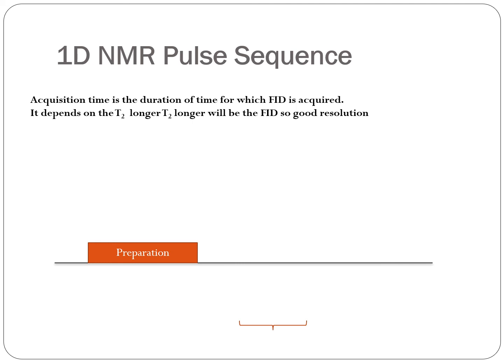So first thing is the preparation, where we prepare our sample and keep it in the magnets, between the magnets, and allow it for some time to get into homogenization. Then we apply the pulse. So now this is just a switch on and switch off. Here we switch on and here we switch off. This is called as 90-degree pulse, or otherwise it is also called as excitation. We just excite it by using the RF pulse.